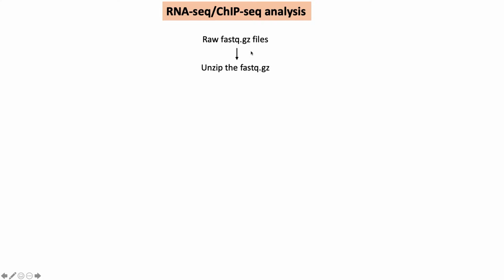Also, while we are on the subject of fastq.gz files, depending on how many reads you have in your sample, the sequencer might spit out a number of fastq.gz files for one sample. Say, if a lot of reads, 4 files per sample, you can just concatenate all of those into one and then unzip and convert it into fastq files. Okay, so now you have your fastq files.